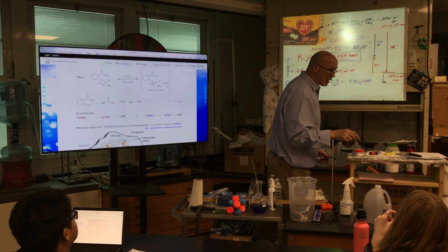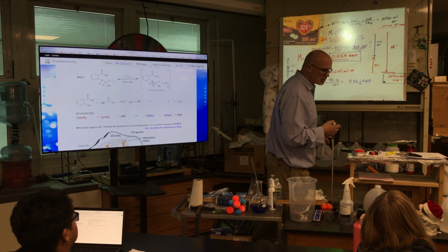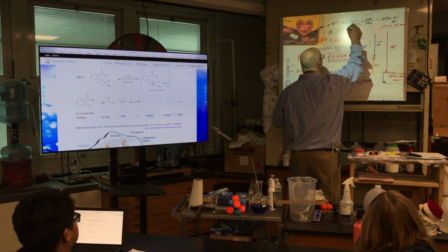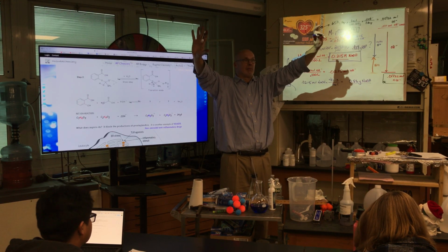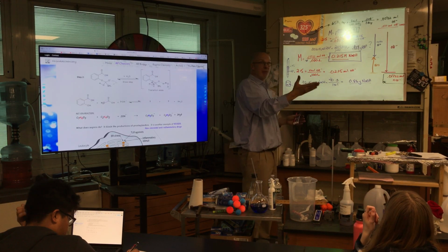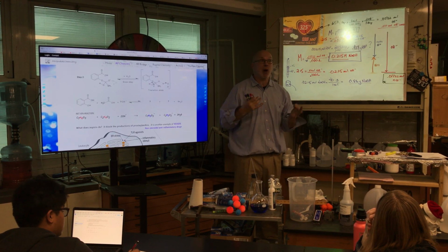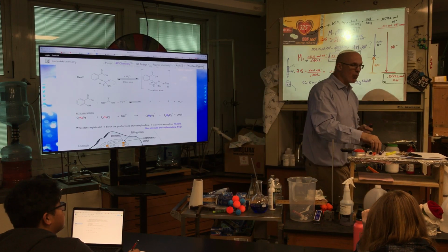Okay, so this is a fake number. Let's say I get 0.119. 0.119 is the new molarity. In this example, you didn't do this yet. What did we project it to be? 0.215. What did we find? It was actually less. You're going to find that. It's reacting in the air. That's why we have to standardize. Everybody with me so far? This is the part where the class before you got lost.